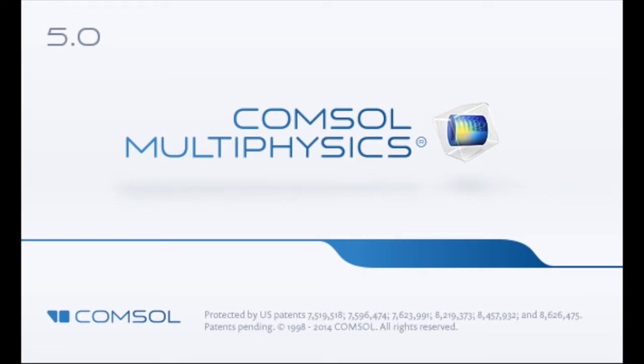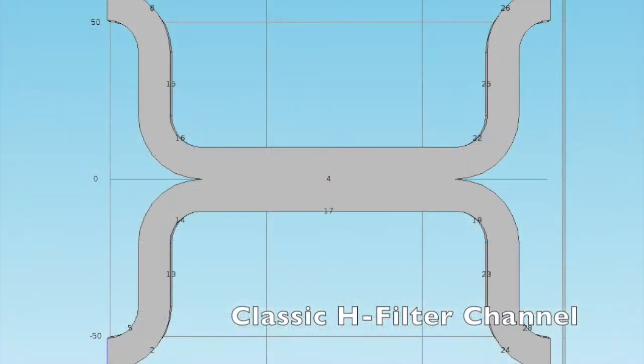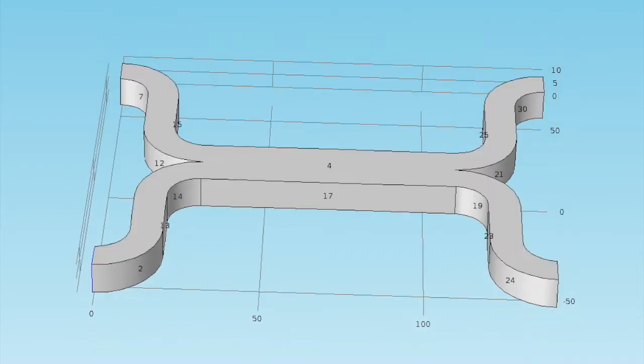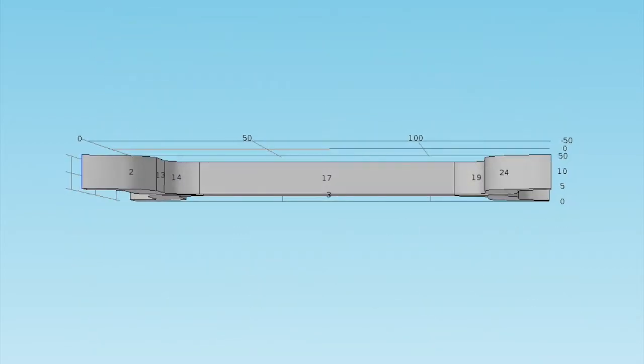Here, we present a 3D model of our microfluidic channel. This was designed using COMSOL version 5.0 software. The channel uses two inputs. In the bottom channel, we inject the subject's blood, and in the top channel, we inject a buffer.